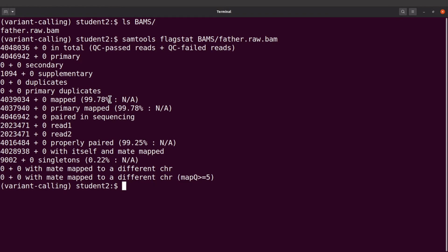This statistics will help you understand what has happened in terms of the number of reads that's mapped. Ideally, we should have the majority of the reads mapping to the reference. This will let us know that indeed we are dealing with the right organism.